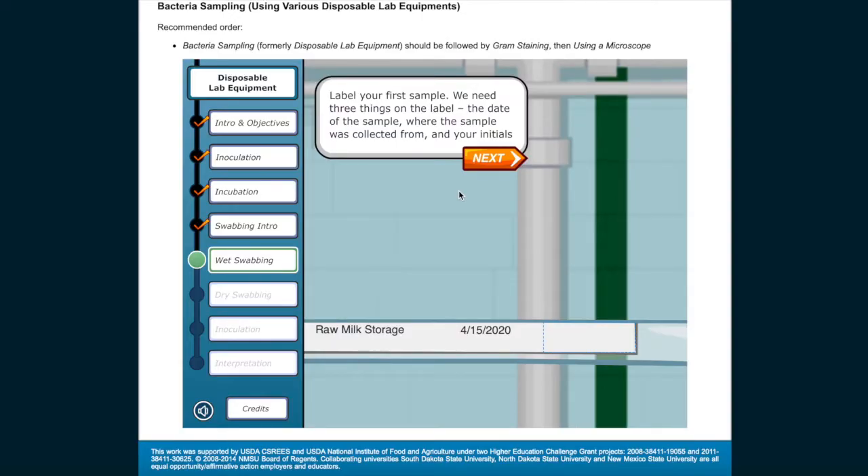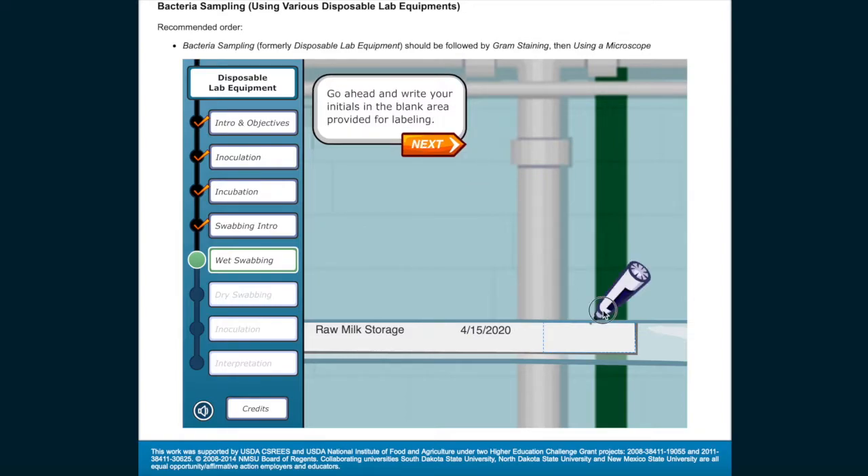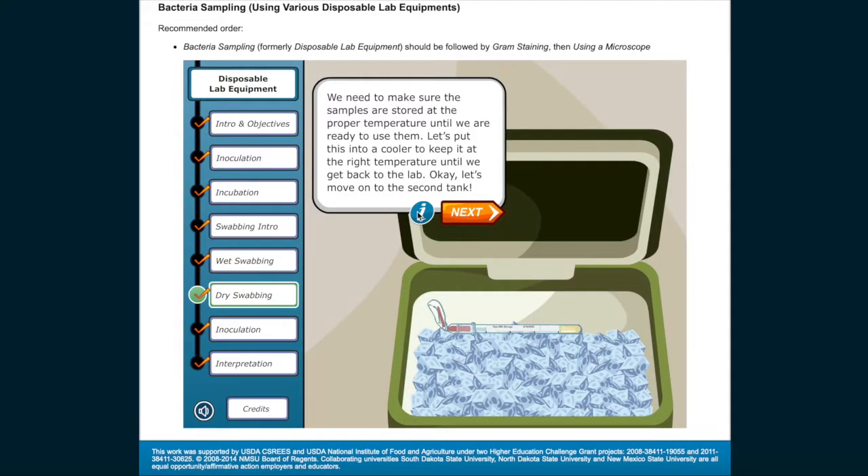Label your first sample with three things: the date of the sample, where the sample was collected from, and your initials. Go ahead and write your initials in the blank area provided for labeling. We need to make sure the samples are stored at the proper temperature until we're ready to use them — let's put this into a cooler to keep it at the right temperature until we get back to the lab. Let's move on to the second tank.